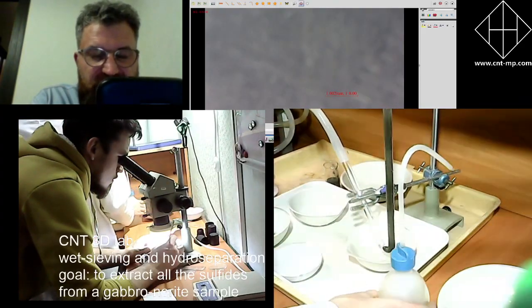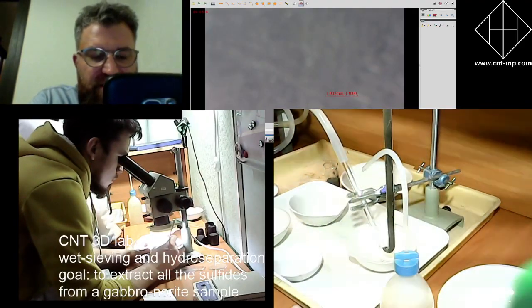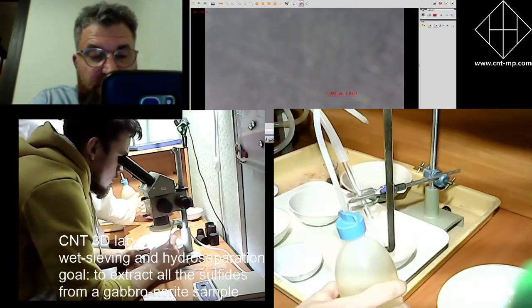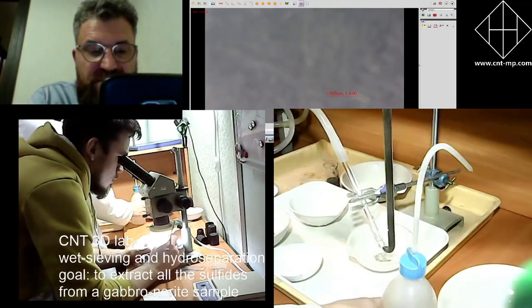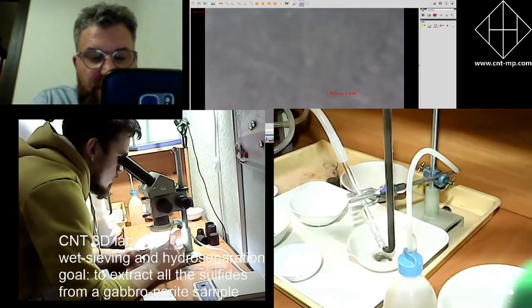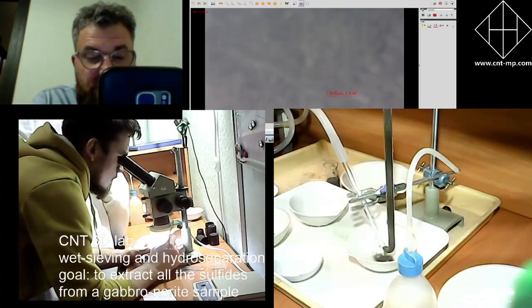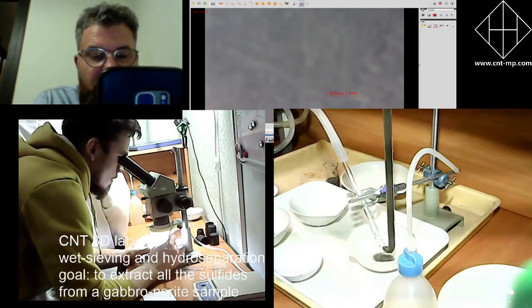So definitely you can use this, or electron probe microanalysis like EPMA. Usually it's this one because you have separate grains, and it's not needed to use chemistry in this case. You can usually use single grain level to understand the chemistry of different minerals, because we are going down to mineral level. We are not having the sample already.